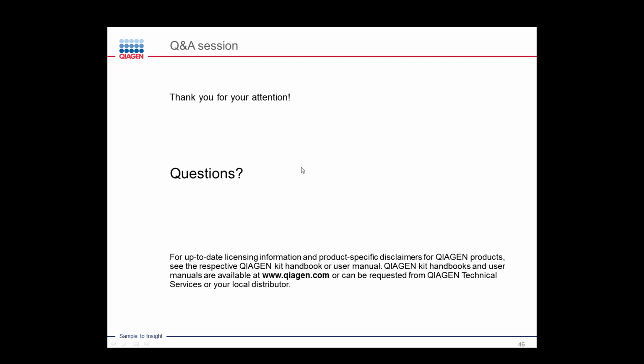Okay, great, thank you. The other question is, can DNase treatment be enough to assure the genomic DNA removal at the isolation step, or would you recommend to use the combinations as you showed on your slides?